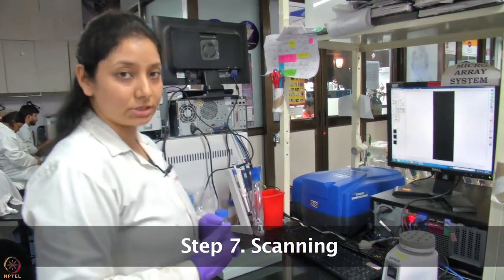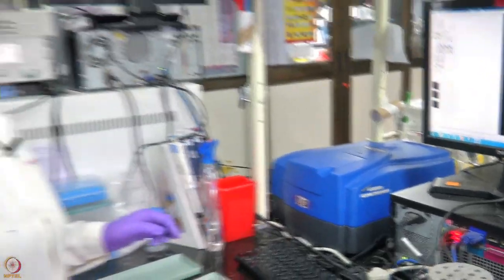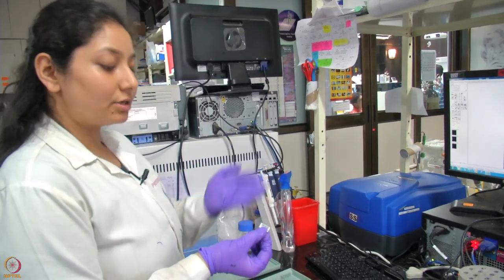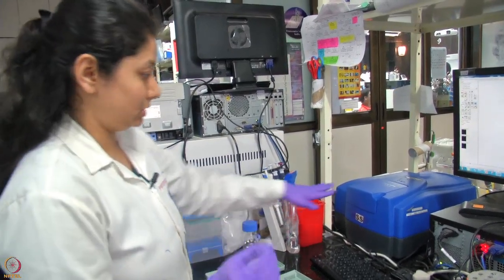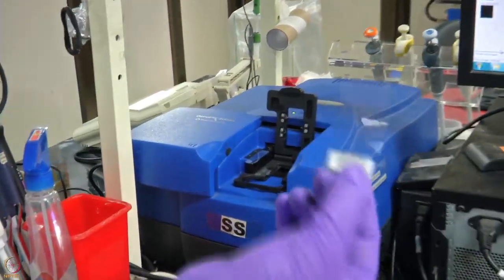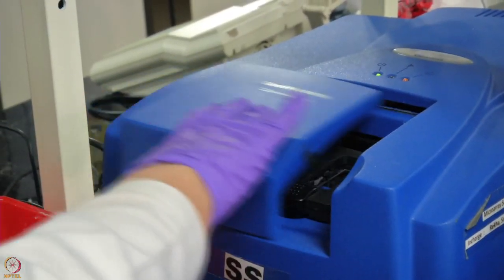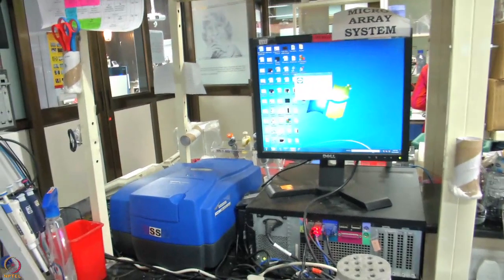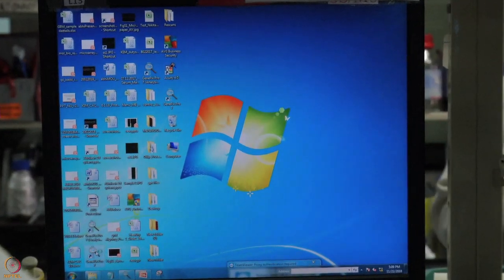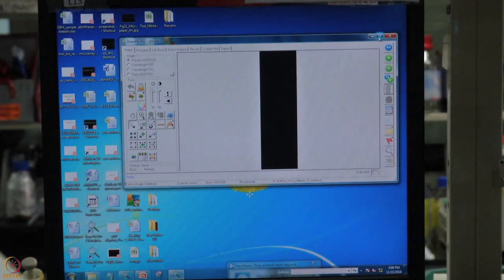For scanning, make sure the scanner is on for at least 20 minutes so that the lasers are stabilized. We place the slide inside the scanner in the inverted position — the surface containing all the proteins should be facing downwards, facing the lasers. We start the GenePix Pro software which comes along with the scanner.